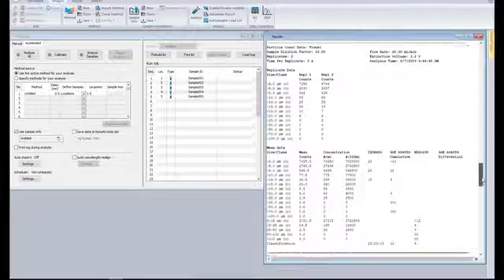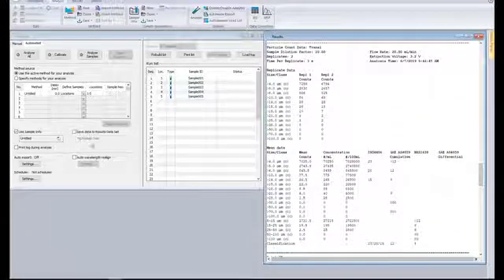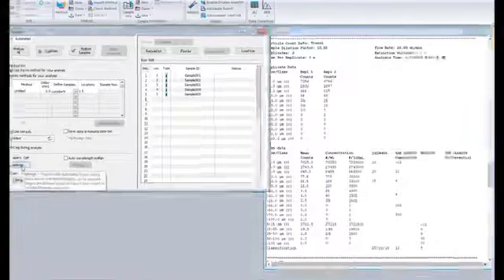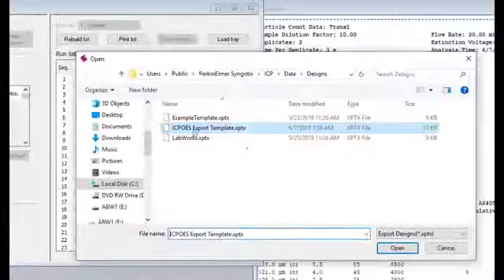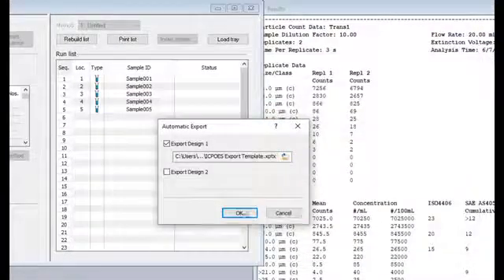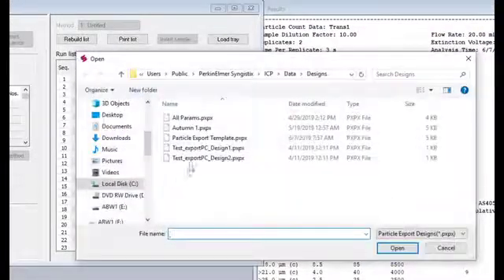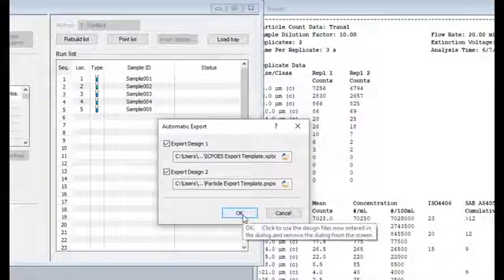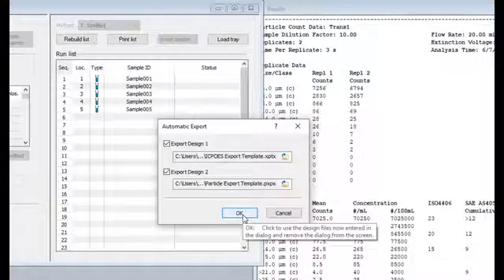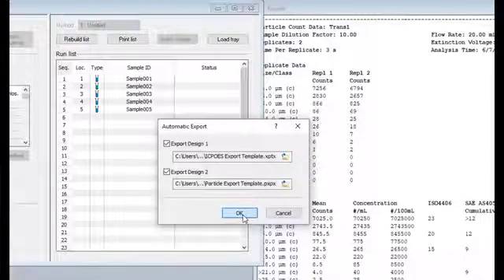And at the end of the sequence, the results will be exported per the templates in the auto export selections. Auto export has one place for each analysis type, ICP and particle counting templates. For those customers with specific formatting needs, a specialized template can be created in the data manager export wizard, and then selected for auto export.